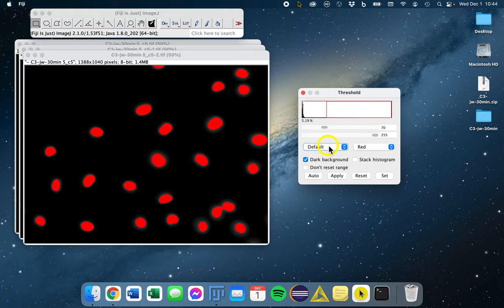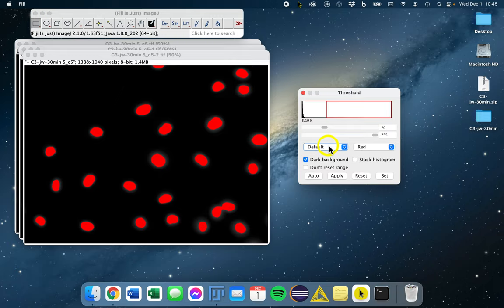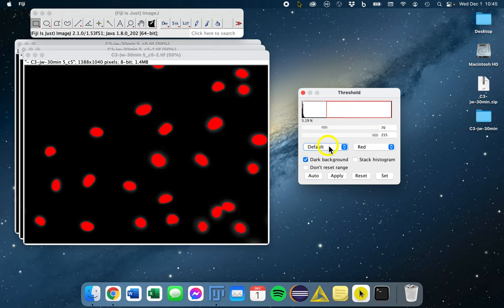In short, auto threshold methods select a threshold based on the distribution of intensities in your image. If the distribution changes, then the threshold will change too. This is also a word of caution. You can bias your measurements, even with auto thresholding, when using the same signal for detecting an area that you are measuring intensities.